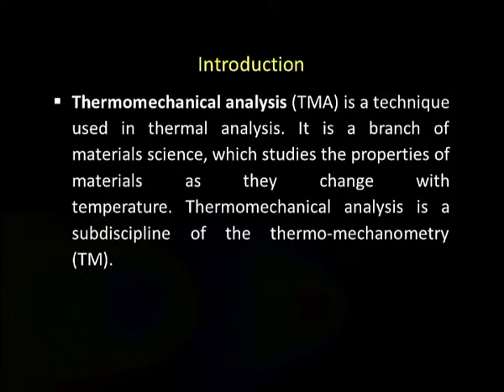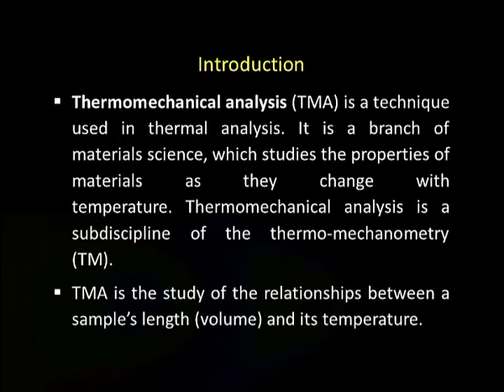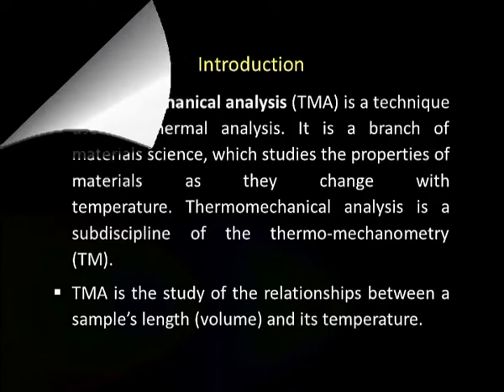Thermomechanical analysis is a technique used in thermal analysis. It is a branch of material science which studies the properties of material as they change with temperature. Thermomechanical analysis is a sub-discipline of thermomechanometry. In short, we call it TM. TMA is the study of the relationship between a sample's length, or you can say volume, and its temperature.